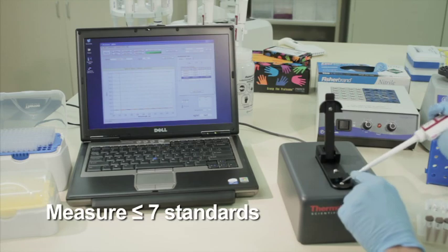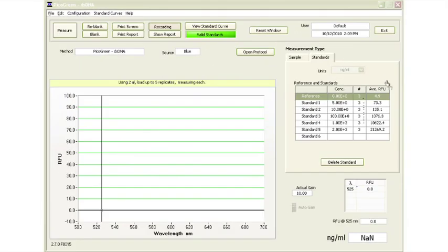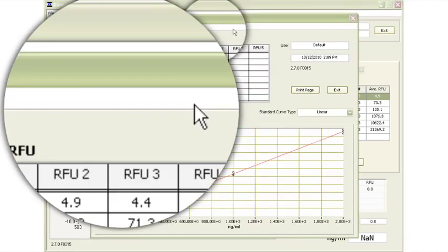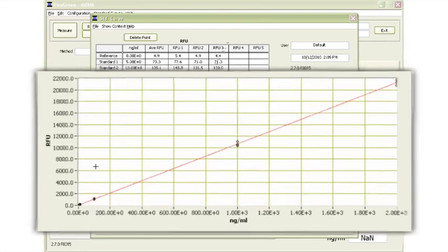Up to 7 standards may be used. The software is designed to store up to 5 replicates for each standard. Replicates of the standards are averaged to generate a standard curve from which the sample concentrations are automatically determined.